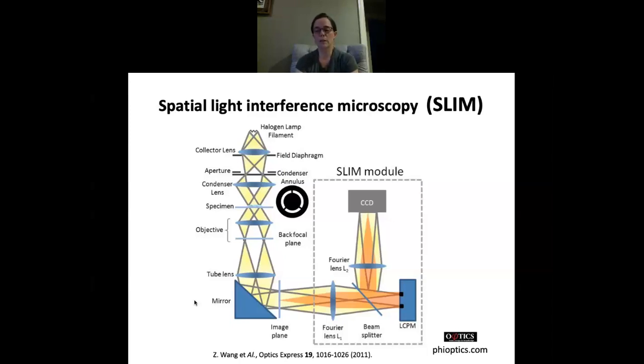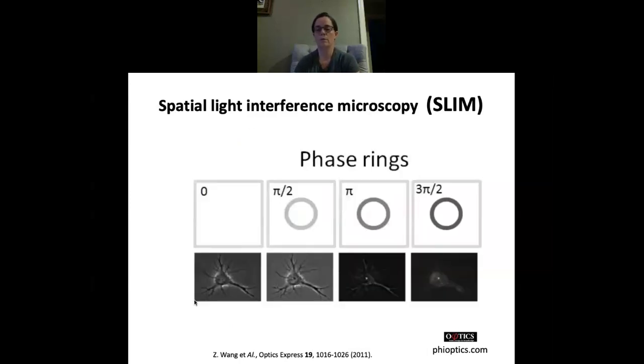The liquid crystal spatial light modulator enables a series of phase images to be captured in which the amount of phase delay in the ring can be shifted by known amounts and at high speed. The liquid crystal modulator can be programmed to implement a ring appropriate to any imaging objective NA. So the optical properties of the liquid crystal are similar to those of uniaxial crystalline materials and are similar to what is used to create static wave plates in traditional phase objectives.